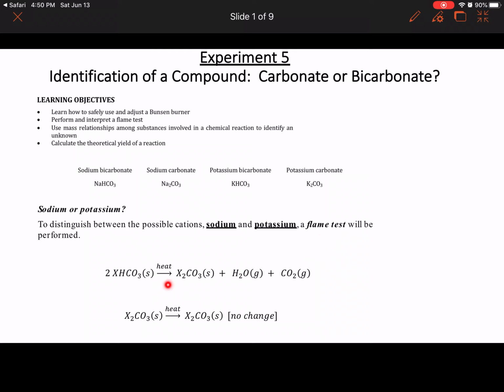So the first thing you're going to do is you will be given an evaporating dish or a crucible. An evaporating dish is something like this, made with porcelain, because we can heat it to a very high temperature. In some campuses we use a porcelain dish like this, which we call a crucible, and the crucible has a little pout over here, and you can put a watch glass on top of it.